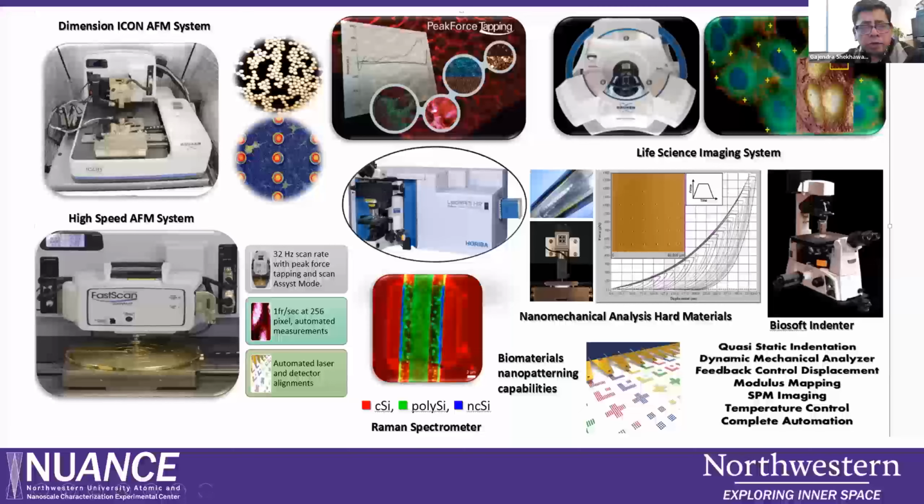Before I go there, let me introduce what we have in this facility. For the last two to three years, we are focusing on moving the SPEED facility towards functional imaging. That means we can add chemical imaging, electrical imaging, mechanical imaging, and so on. Instead of doing simple surface topography, where users just measured surface profiles, we are shifting the direction towards more quantitative analysis.